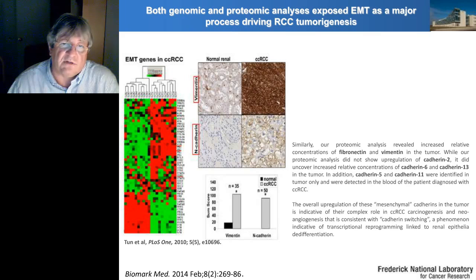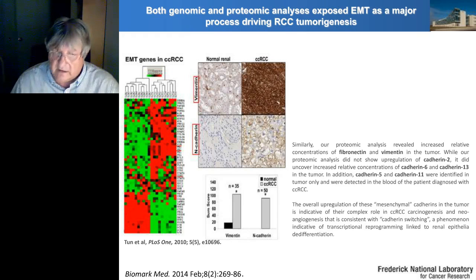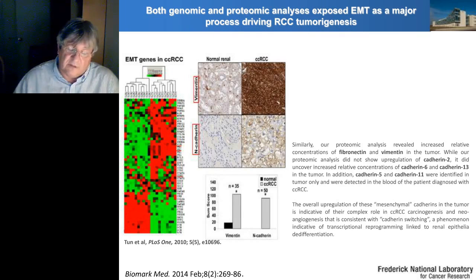Again, we have also seen vimentin as upregulated in renal cell carcinoma, and cadherin as well. So that gives us another confidence that our approach is something that definitely can be followed further with genomics, and we really do believe that proteogenomics analysis studies will definitely be important. So what we are showing here, really, are the proteins that we found that are in sync with findings of genomic study. The proteins that we found differently expressed are not really the part of this presentation.